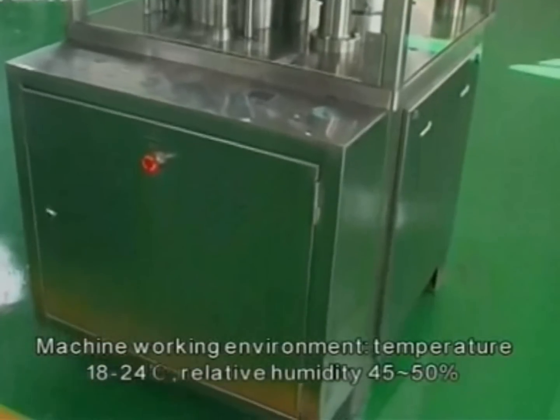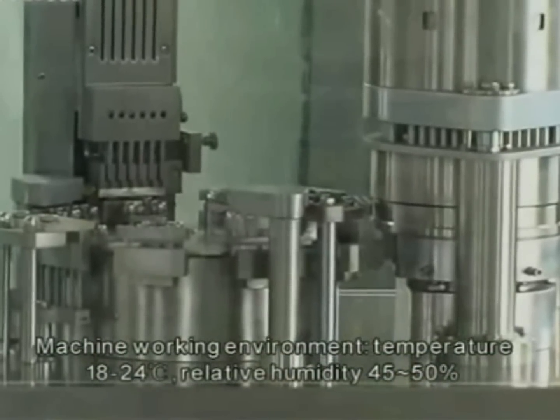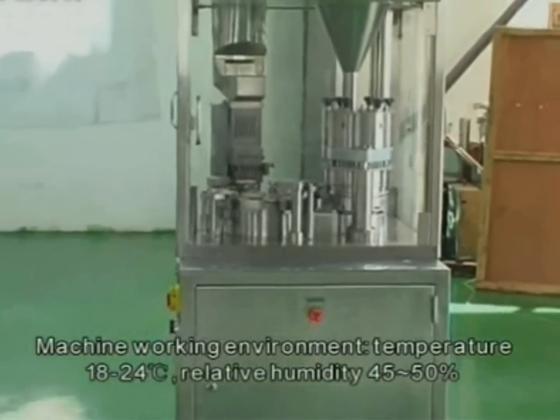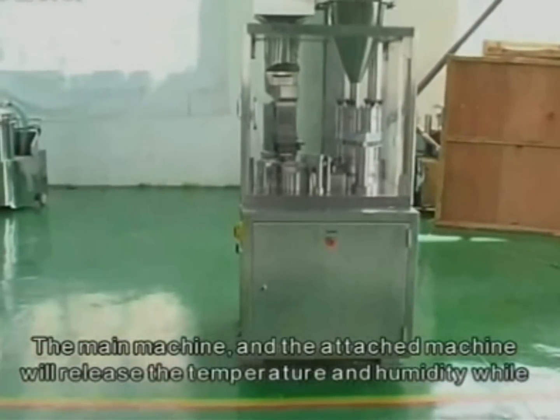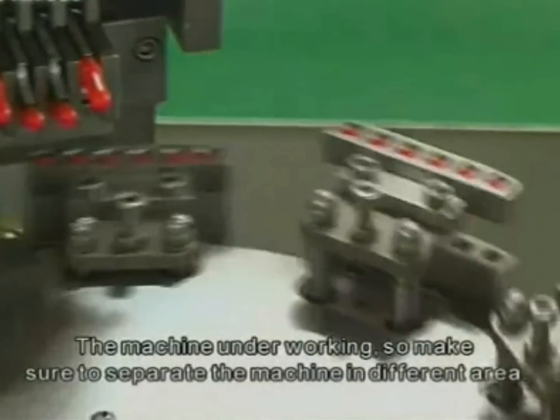Machine working environment: temperature from 18 to 24 degrees centigrade, relative humidity 45 to 50 percent. The main machine and the attached machine will release temperature and humidity while the machines are working.